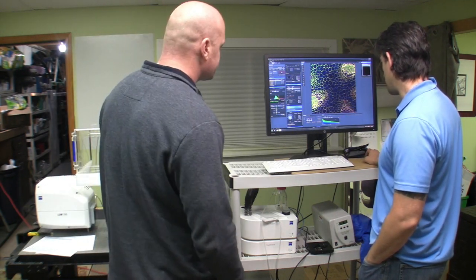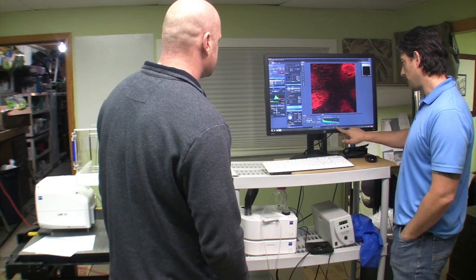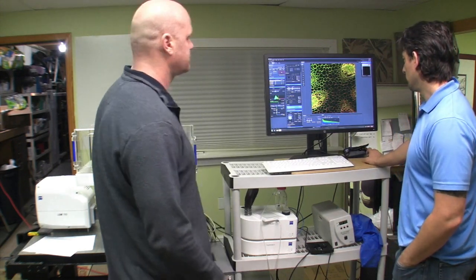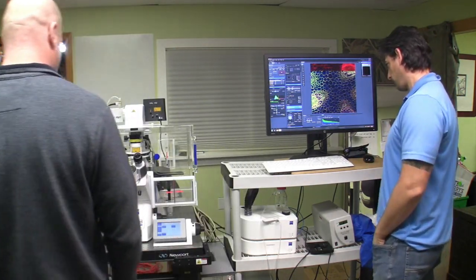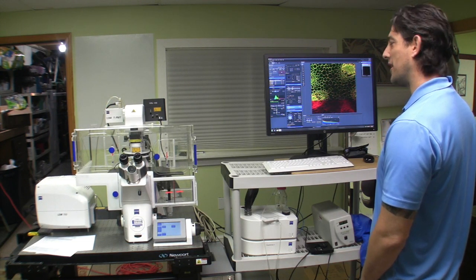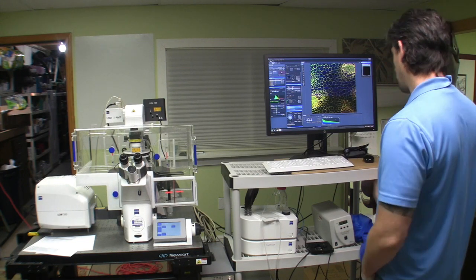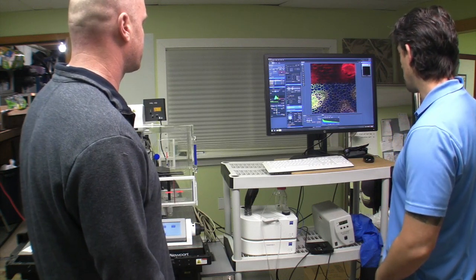It says there's 3 minutes and 20 seconds left of a 6.5 minute experiment. So 3.5 minutes left. And after that I can just check to see the zoom works, and that's pretty much it. This is operating exactly how I would expect.